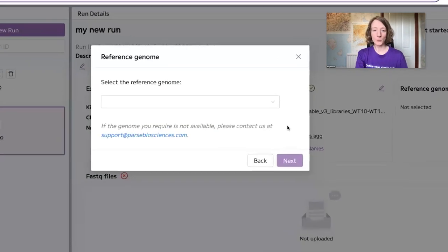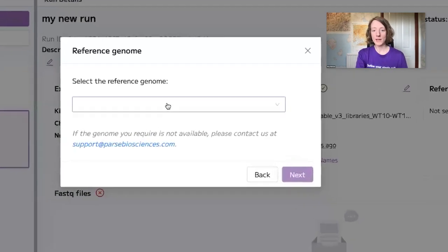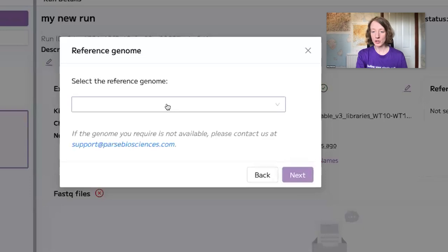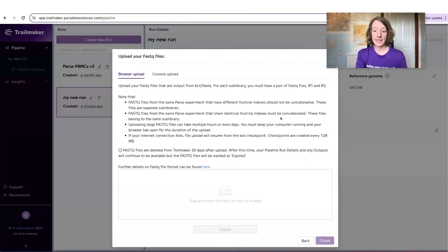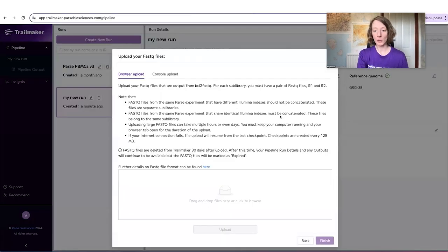In the next step of the wizard, you select the reference genome that you would like to align your data to. In the final step, you upload your FASTQ files.